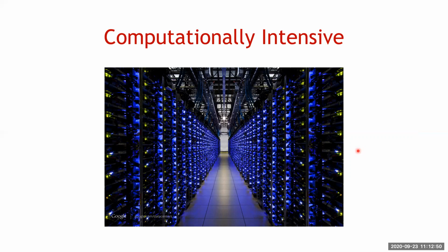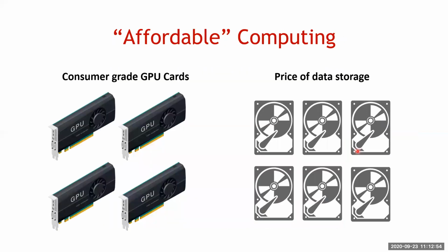Nowadays it's much, much easier because, to put it very generally, the price of computing has gone down, and we've been able to take advantage of graphics processor cards, or GPUs. It's always been the case that the architecture of GPU cards is that they have many cores.